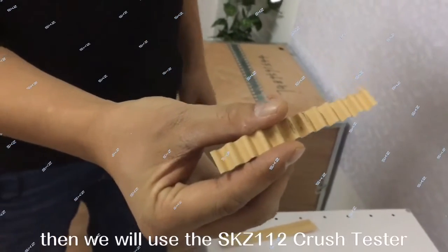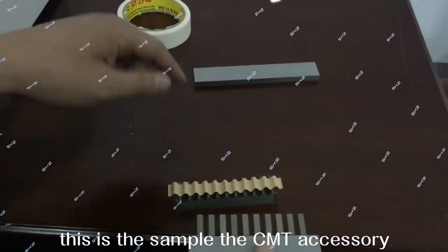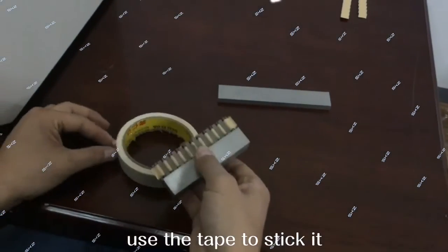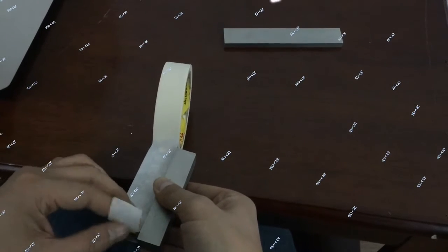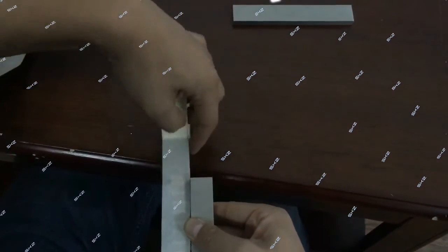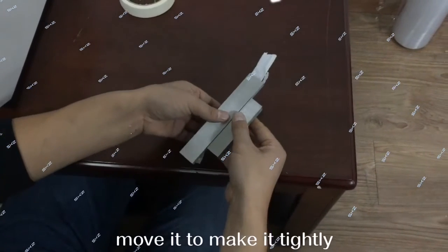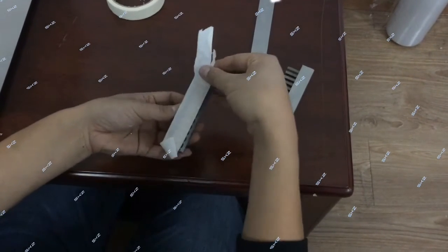This is the sample. Then we will use the SKZ112 Crush Tester to test the CMT. This is the CMT accessory. Put it here, and use the tape to stick it. Move it to make it tight. Then take this one. Sample finished.